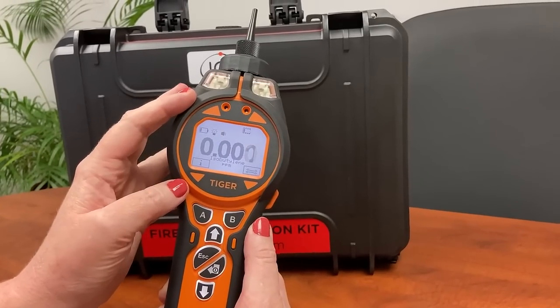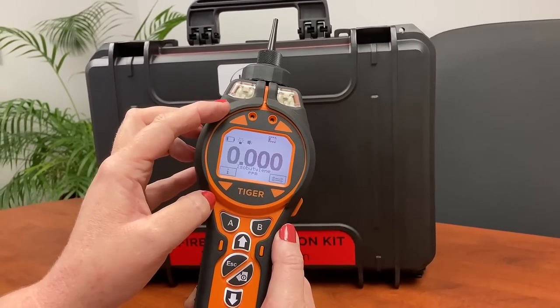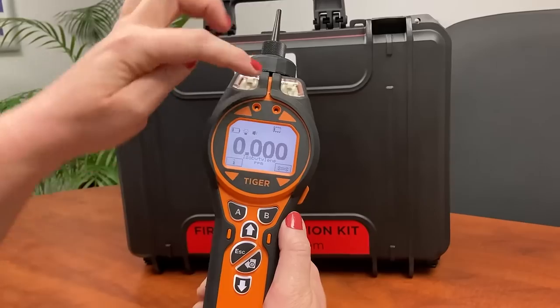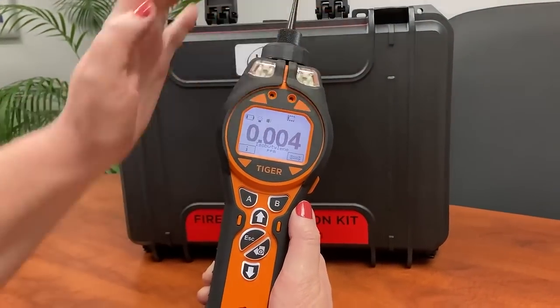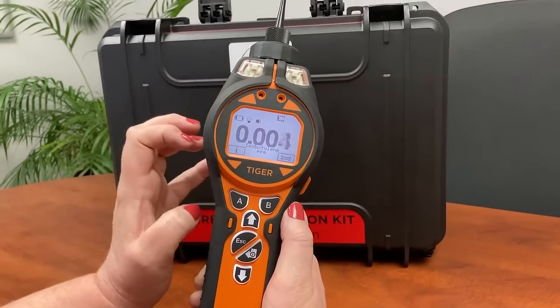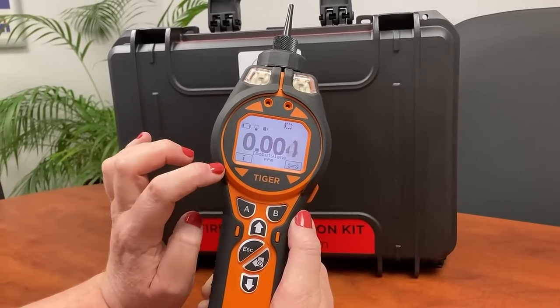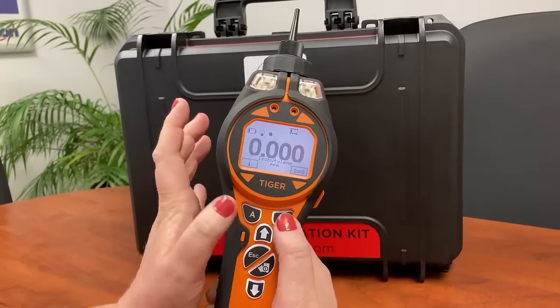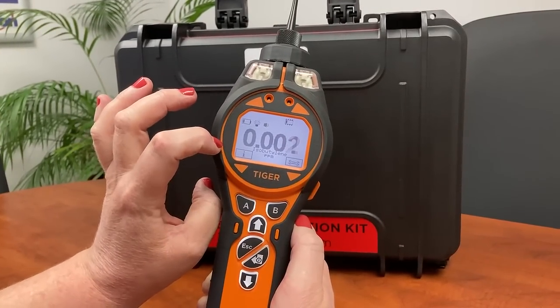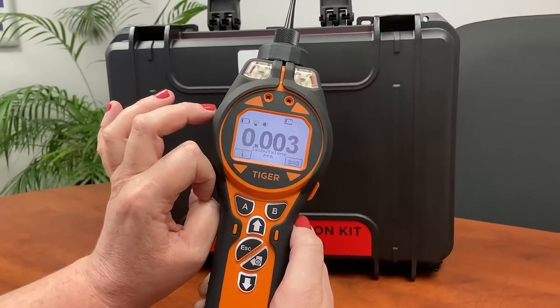On our home screen, the left hand button shows our battery status. We've got a backlight which is on, our alarm sounder is on, and our data logging icon on the right hand side shows that there is some data already saved on the instrument. Bottom left and right are our hotkey buttons operated through the A and B buttons, and in our center line we've got our concentration and what gas is being detected.